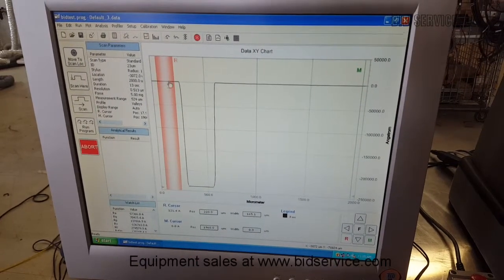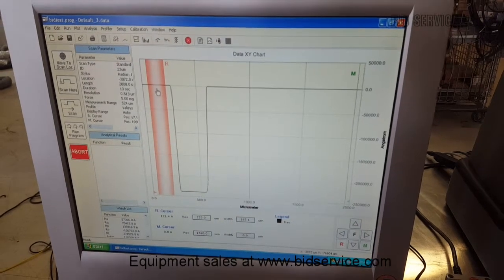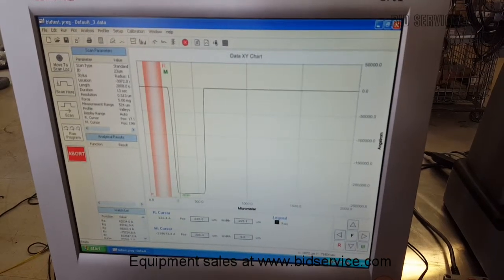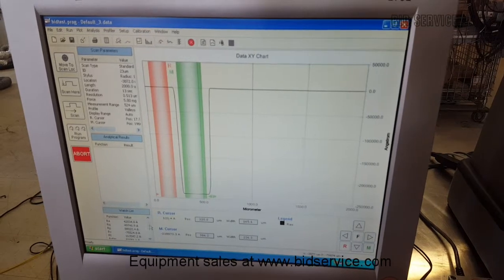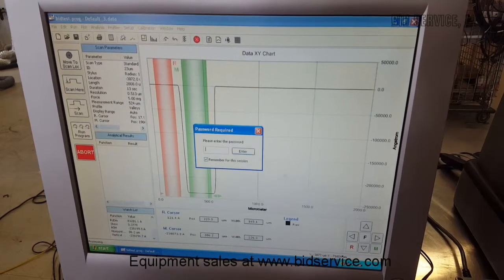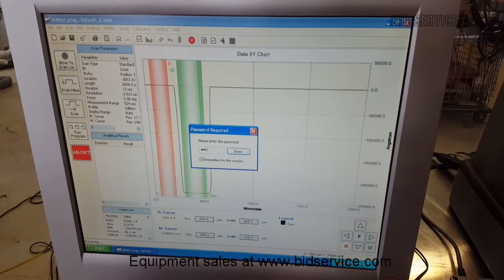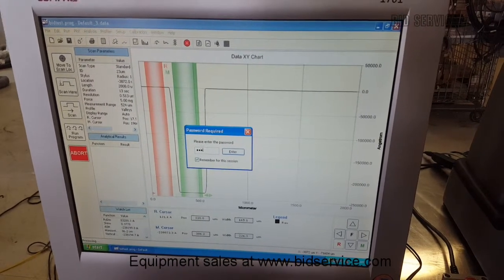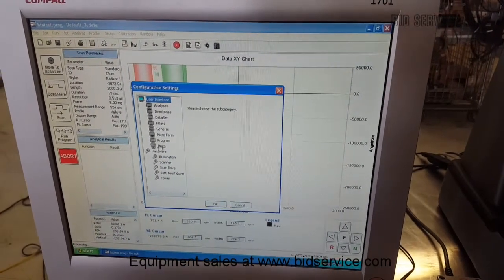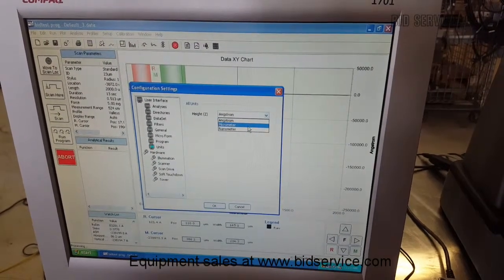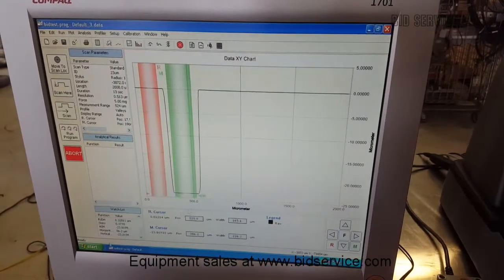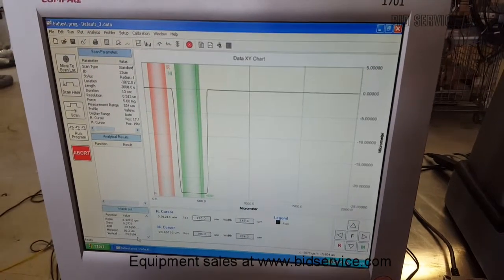Now if you had a sample with noise, you can use this filter here — it averages the height between the filter. You can also go to setup, configuration, and the password is decktech32. Go to units, and you can change your units from angstroms to microns, which would match the standard. As you can see here, it's 23.8194 as the measurement.